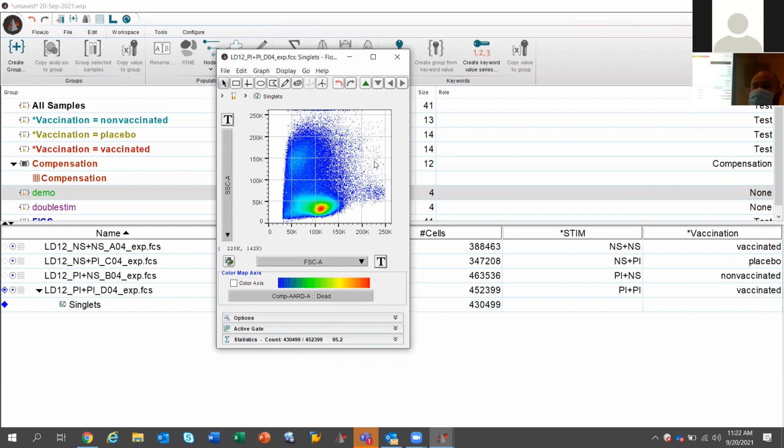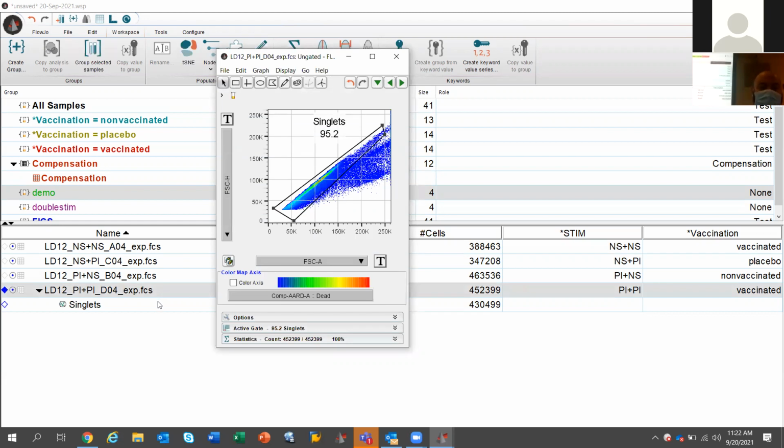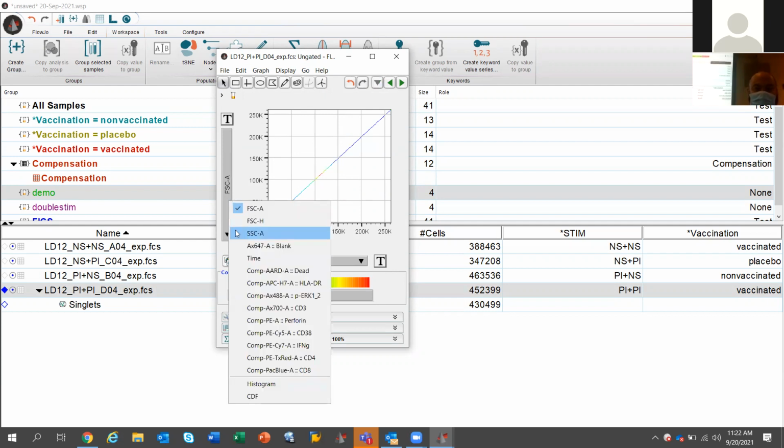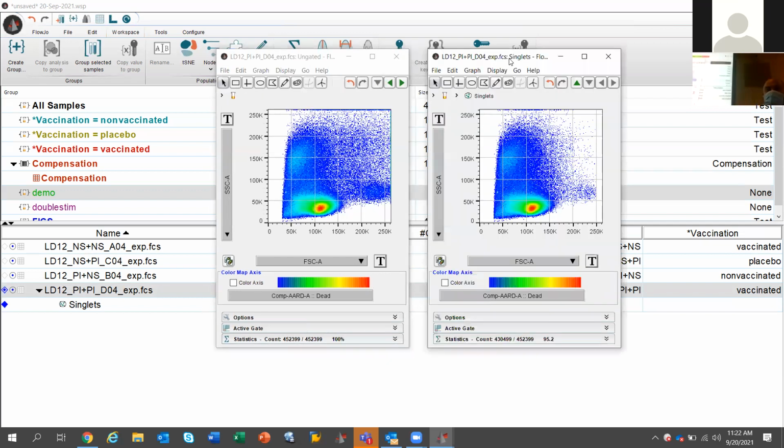And now you can see that when I did an exclusion of singlets, just by doing that little level of QC, and let me revert back, oops, just so you can see how messy it was versus what it looks like now. On the left, you have non-removal of doublets. On the right, we have the doublets removed. You can see that it's very difficult to tell where the granulocytes start and end from this area where you would find the majority of the lymphocytes.